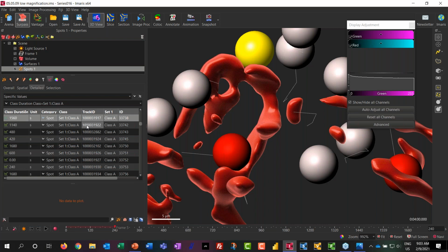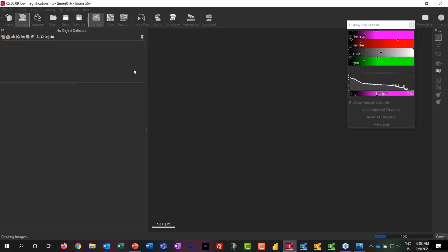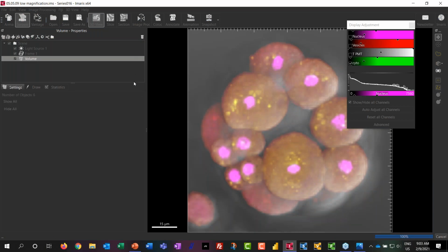Okay. Maybe one more additional question about spatial view. I'm not sure if you showed it, most of our examples were related to the intensity or distribution outside the surface. Is there also an option to compare with random distribution inside an object?